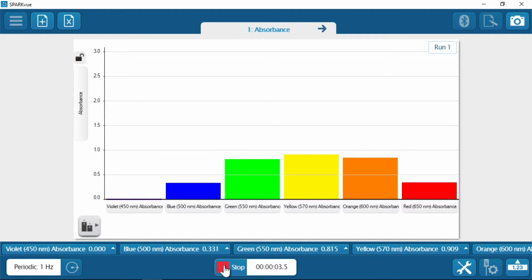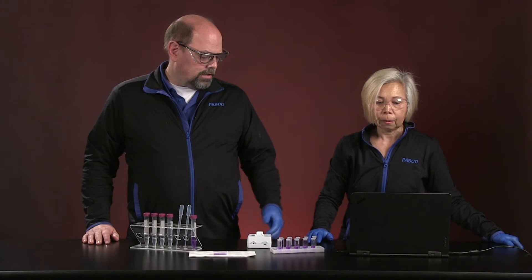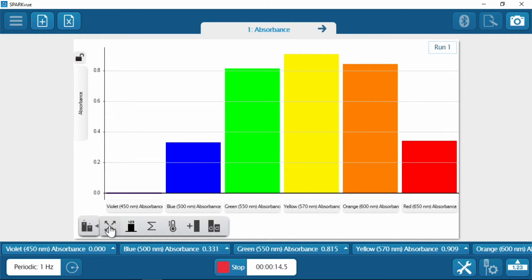And I will take one sample of our crystal violet and let's look exactly where the absorbance happens. Oh, we've got some bars. Let me use the toolbar over here to actually scale the numbers up. Now, Carolyn, this looks purple and I see the biggest bar on there is yellow. What's that about?